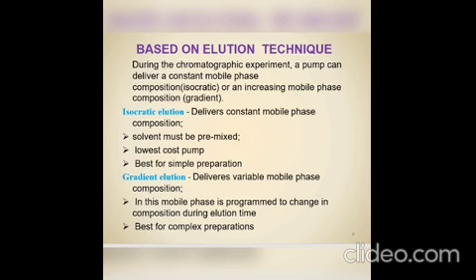It means if it is a single peak analysis, we mainly go for isocratic elution. If there are 2 or more peaks, meaning 2 or more components in one product, we mainly go for gradient elution for a good separation.